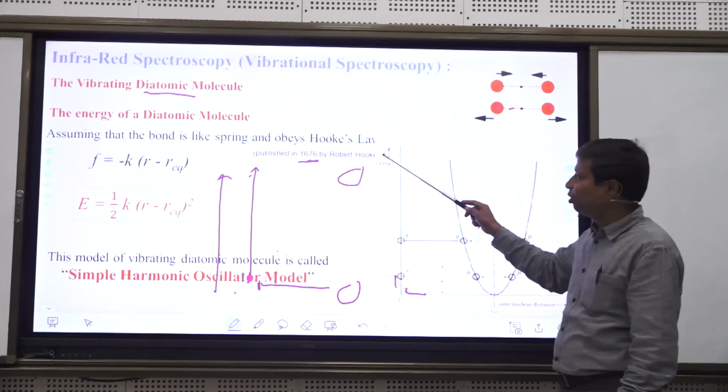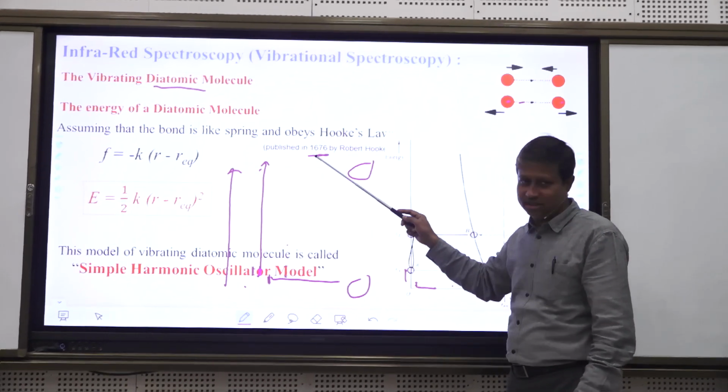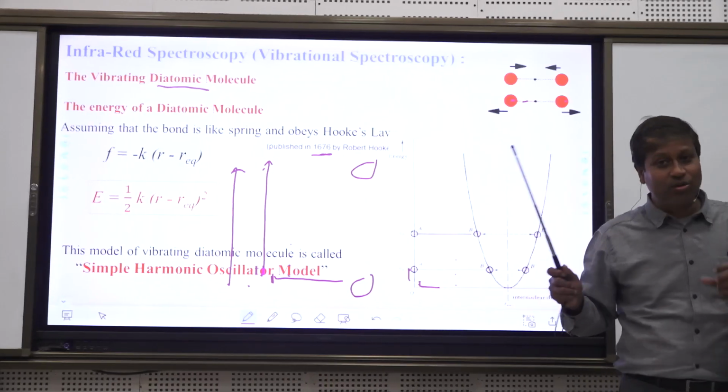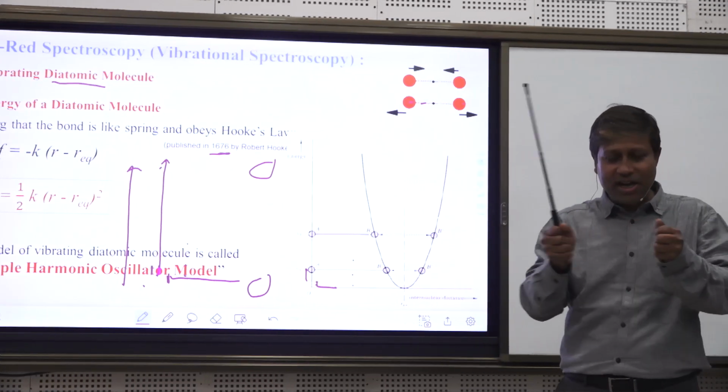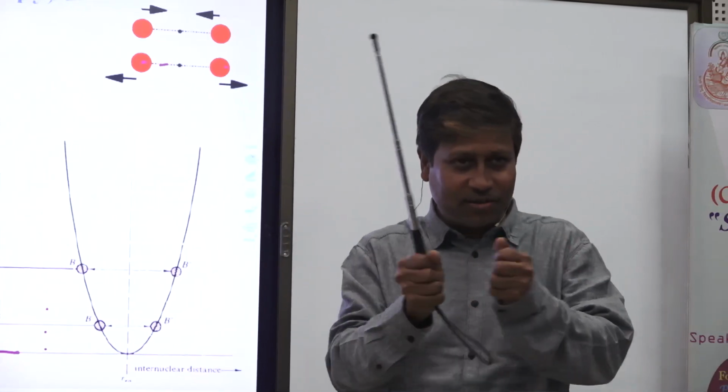In 1676, so long back, Robert Hooke imagined that this vibration is like a spring motion. The spring is vibrating.